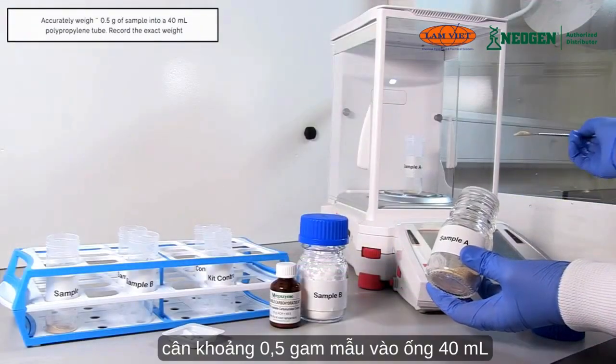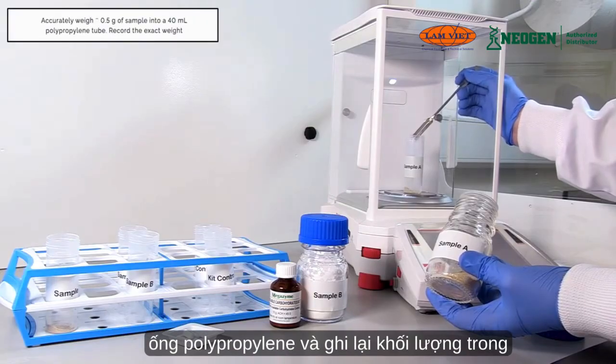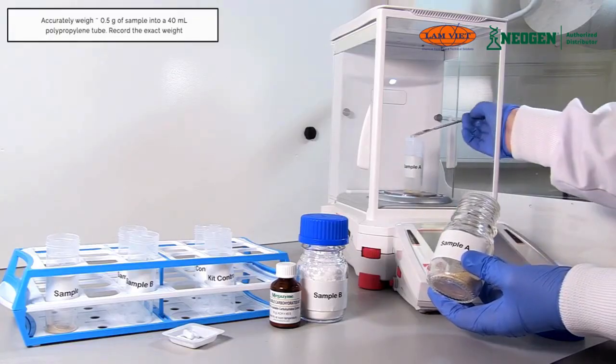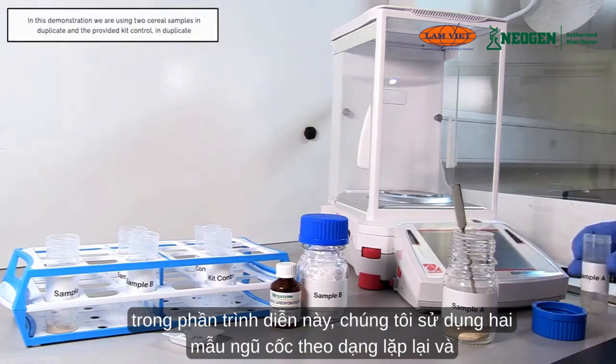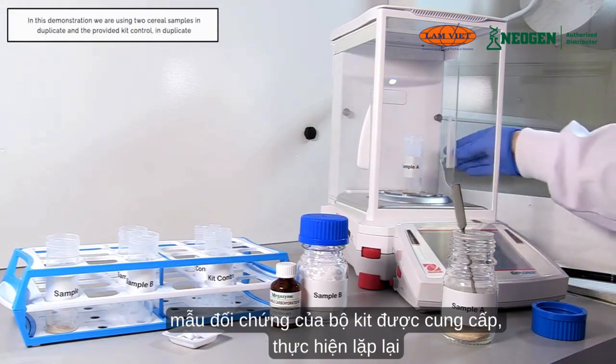Accurately weigh approximately 0.5 grams of sample into a 40 ml polypropylene tube and record the weight. In this demonstration, we are using 2 cereal samples in duplicate and the provided kit control in duplicate.